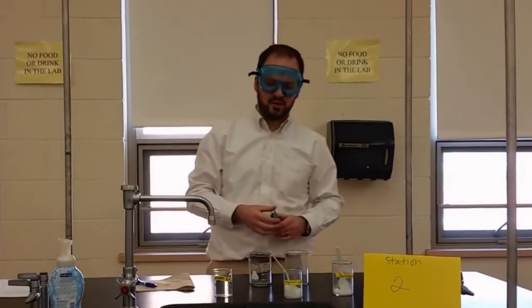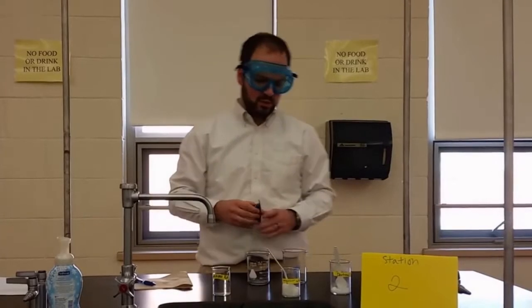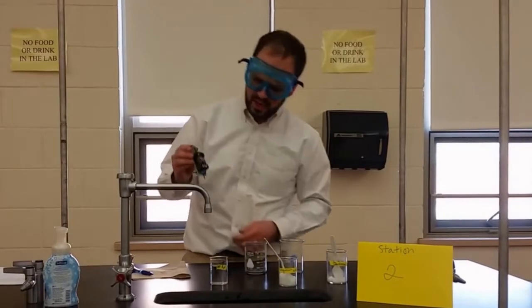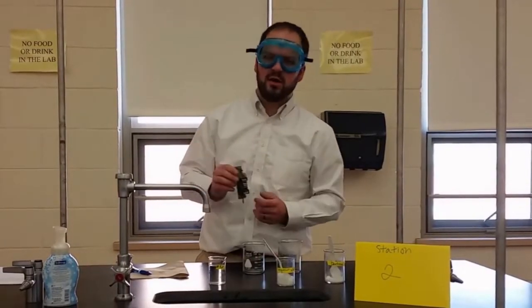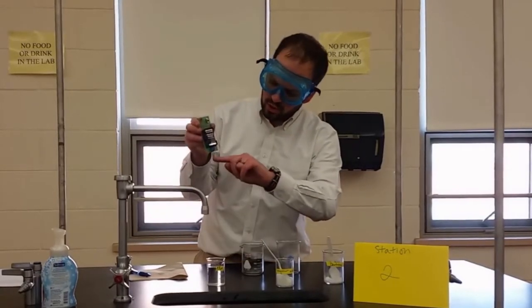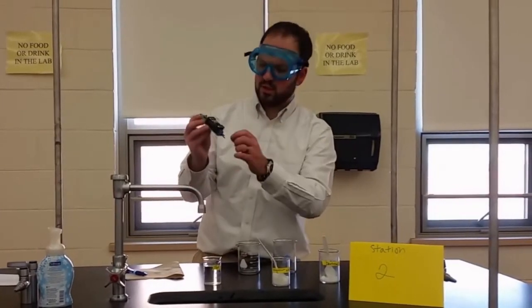In other words, how well it conducts electricity. What we're going to be doing is testing how conductive these substances are in the water. An interesting thing to do first, though, is to take the conductivity meter and try it out on distilled water and take the data from that.